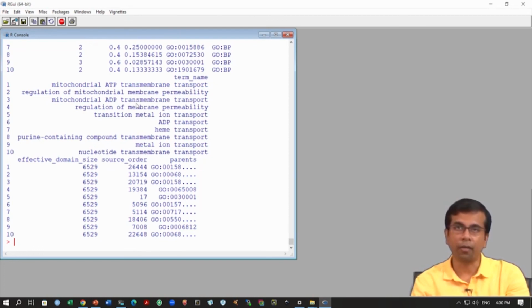So, we have covered a lot actually. We have started with the data mapping, where we actually mapped using HISAT2, and we have done the raw counting, raw count data we got after using HTSeq count, and in this set of hands on we actually processed the data through all the steps. So, from bias correction to normalization to differential expression analysis and finally to functional enrichment analysis.